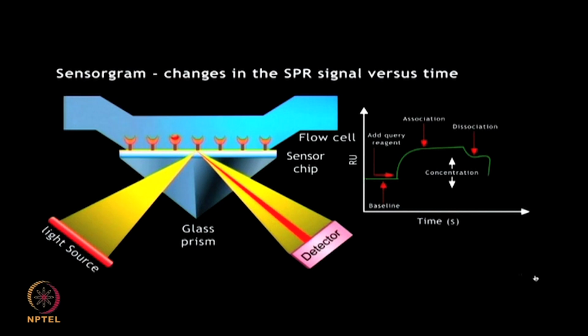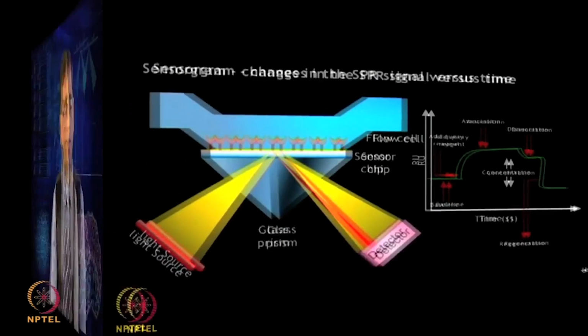After the SPR run is finished, the same chip can be reused by applying a mild acid treatment and further washing steps, by a process known as regeneration.